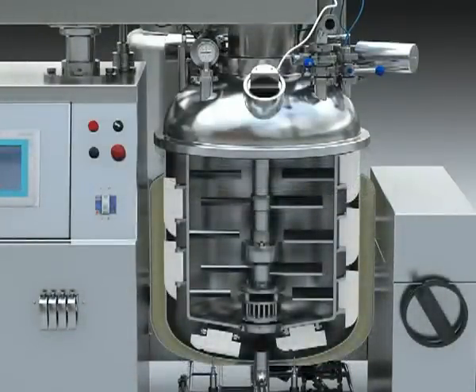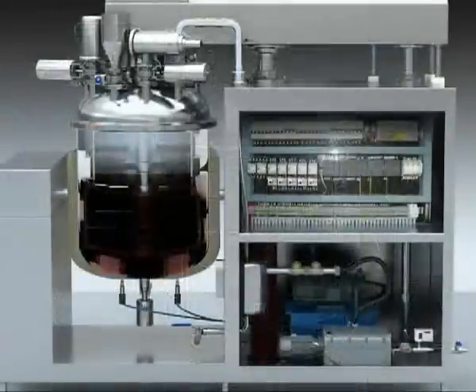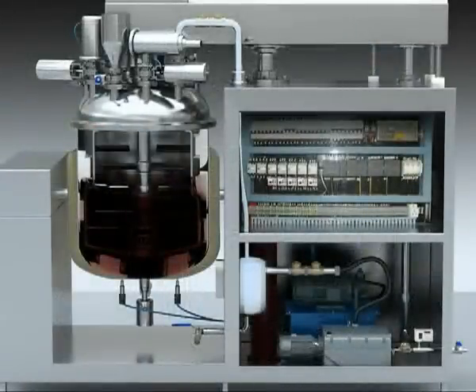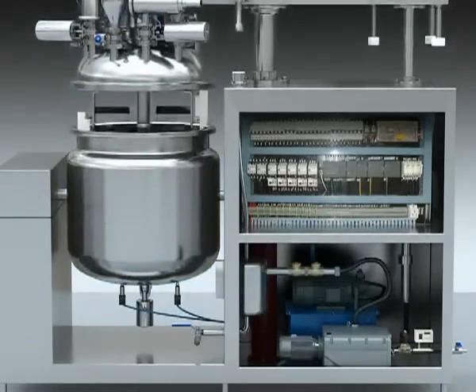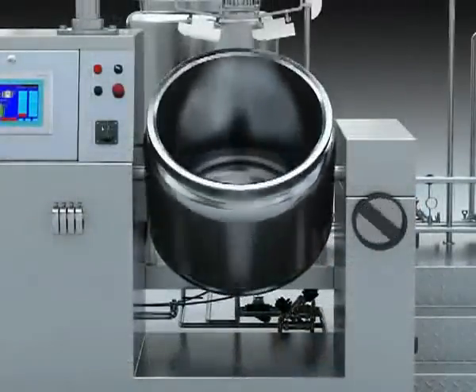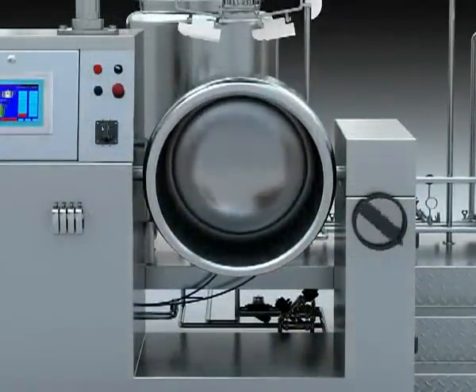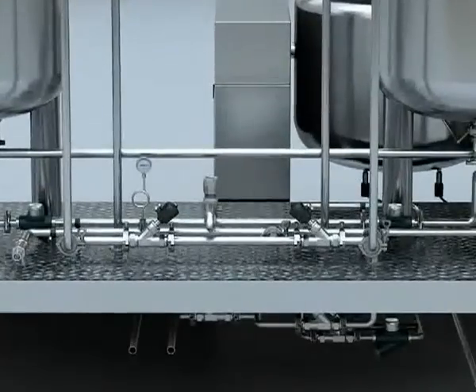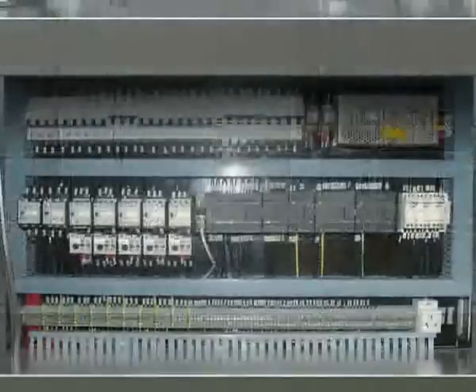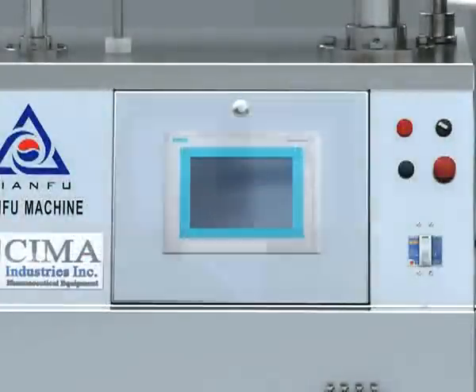The machine is made up of a pre-treatment tank, vacuum emersification blending tank, vacuum pump, hydraulic system, pouring out system, electro control system, and workable.